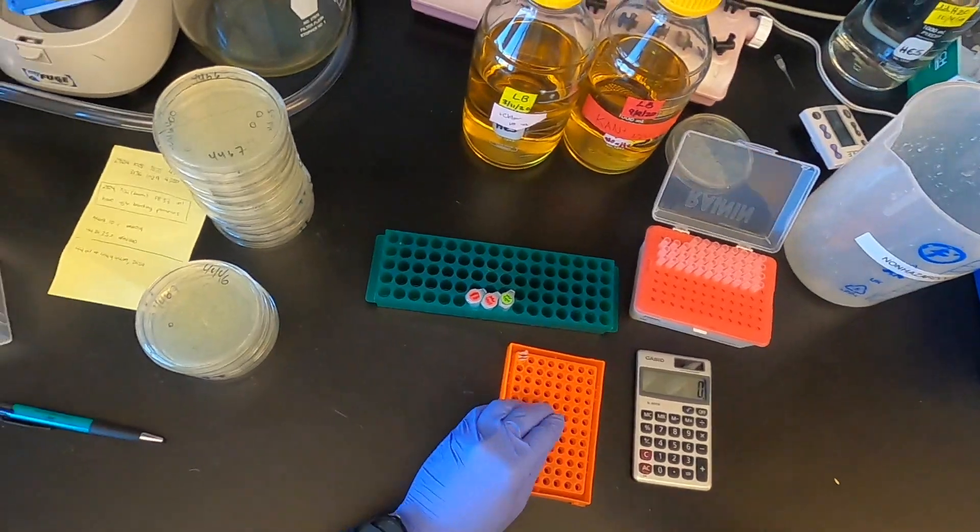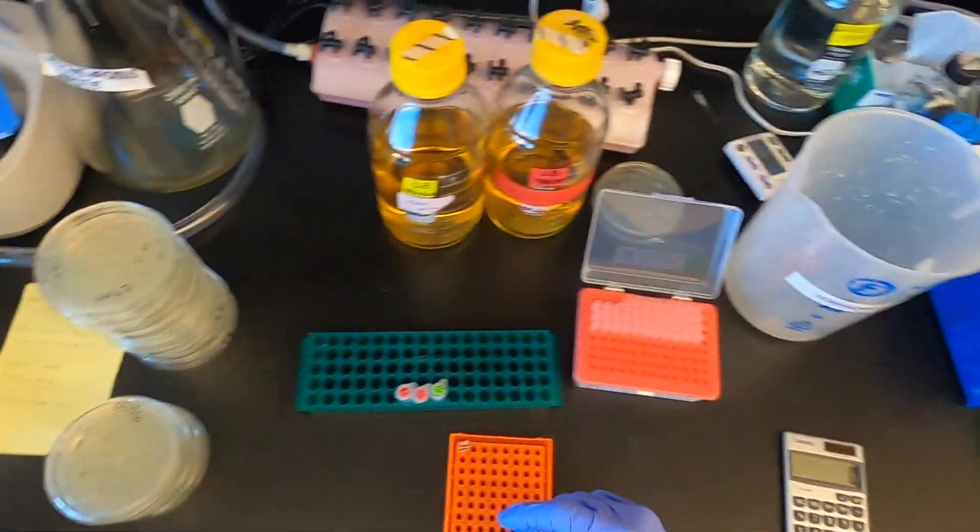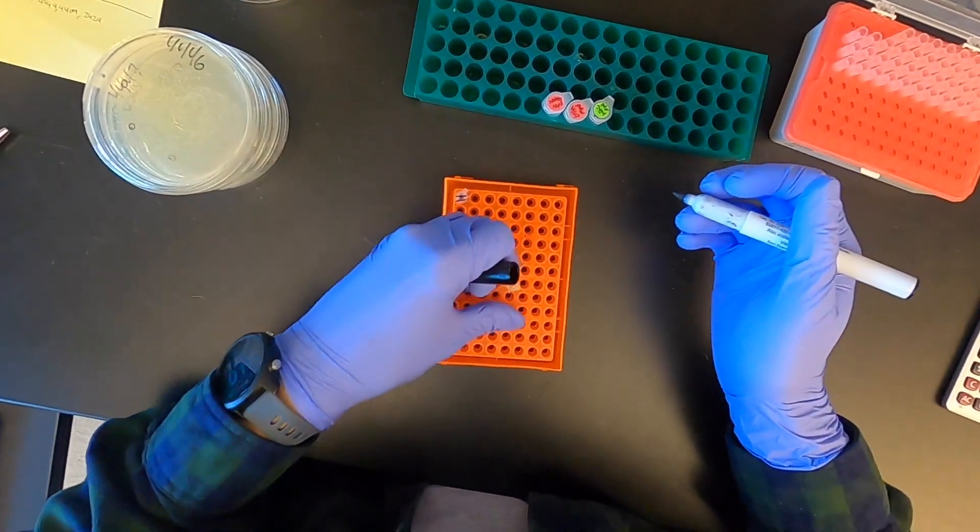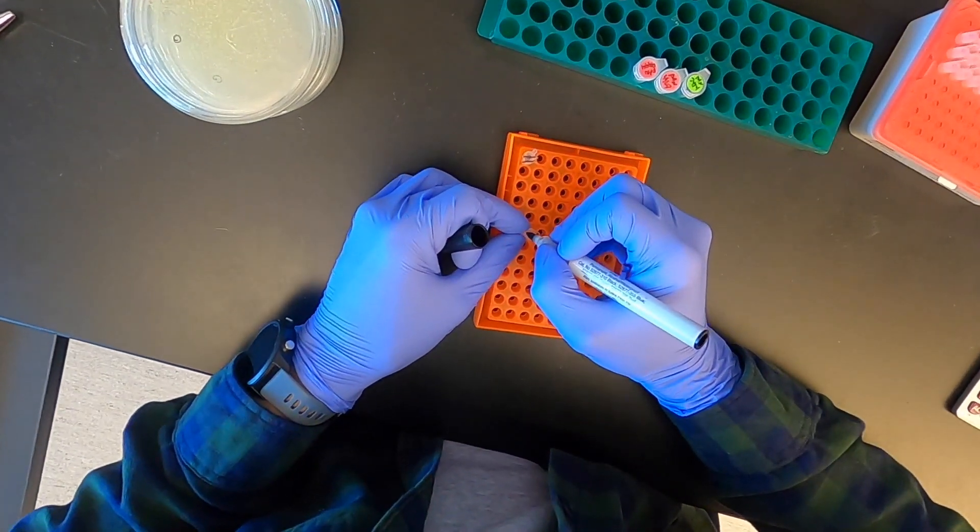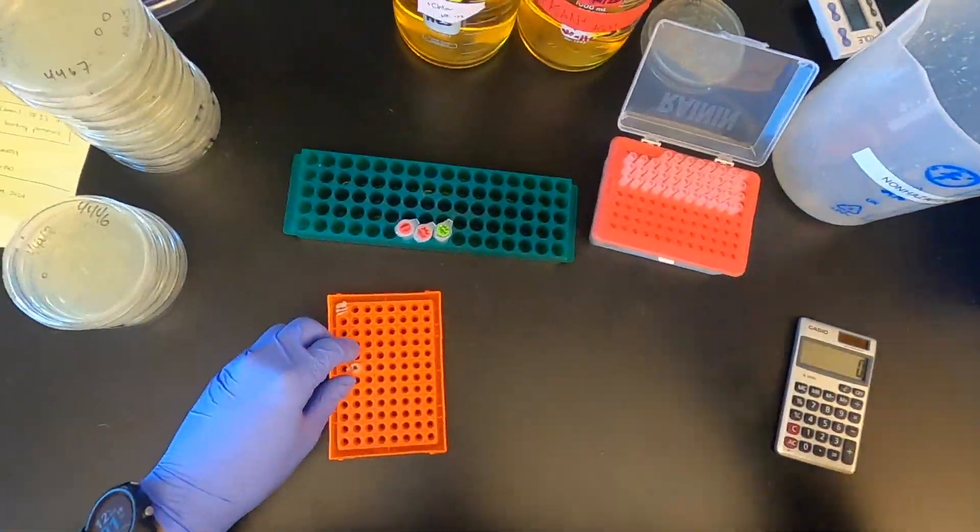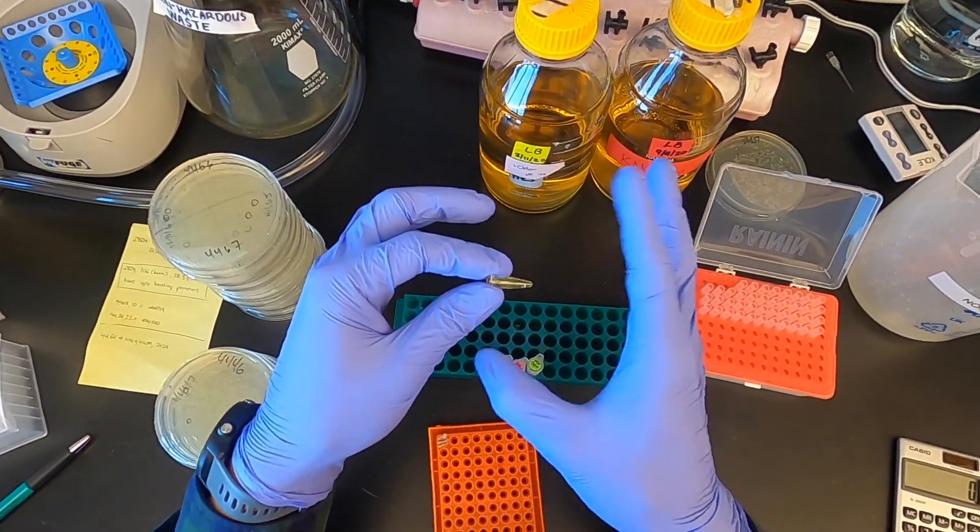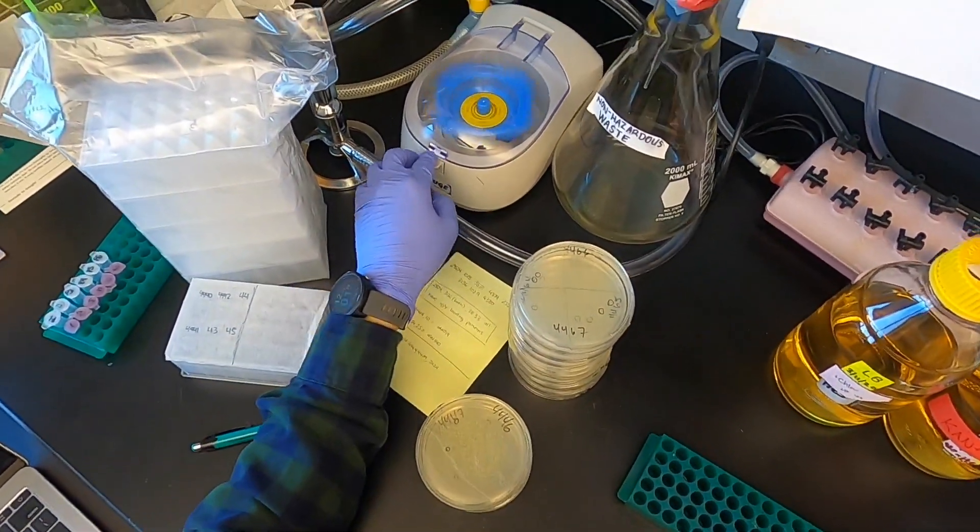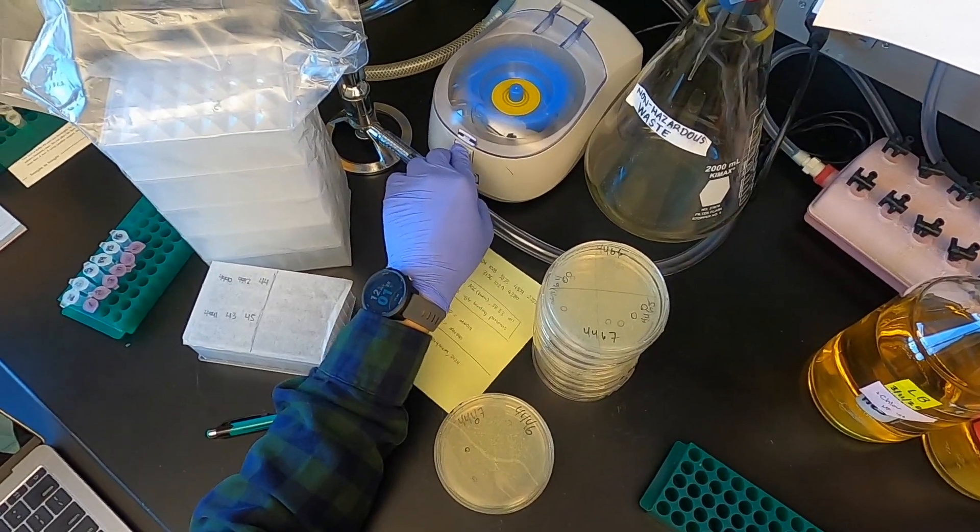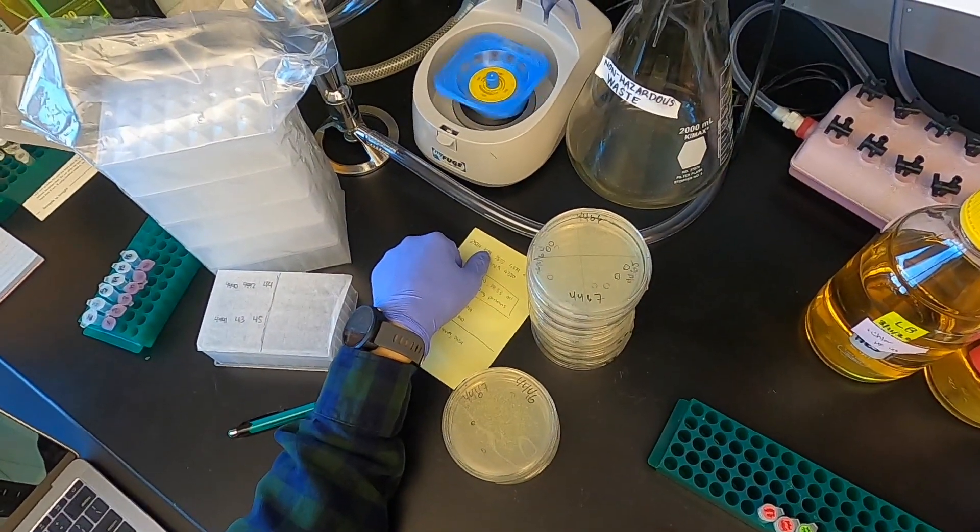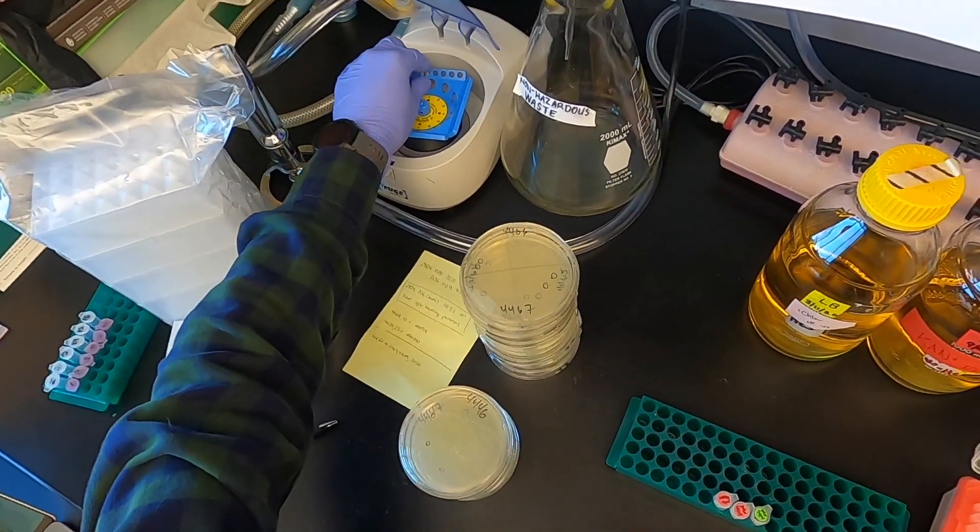Now I will label that tube with a marker. 64. And then I'm going to flick the tube to mix the contents and then spin that down in the centrifuge. Perfect.